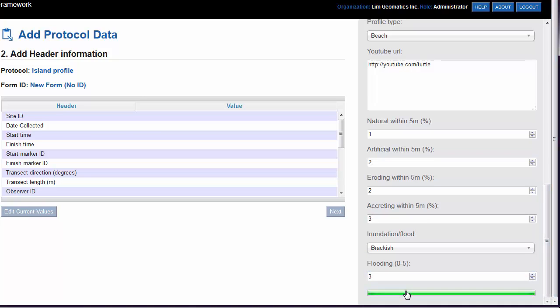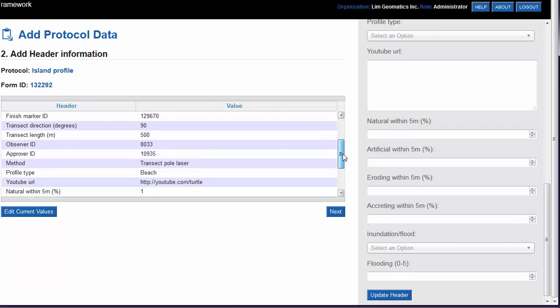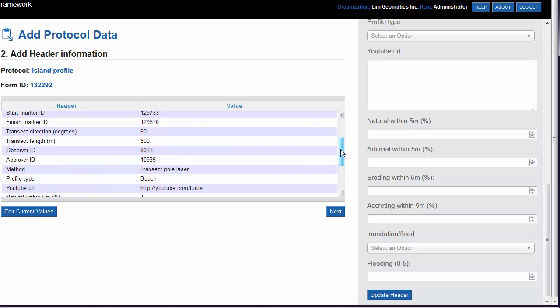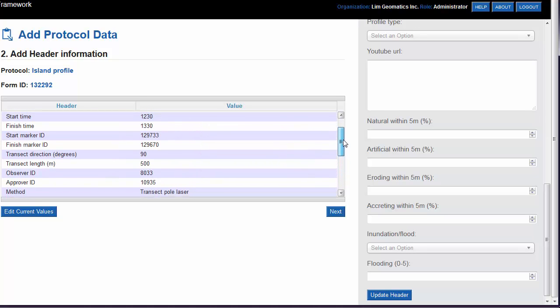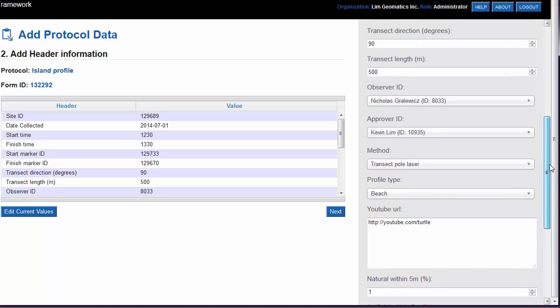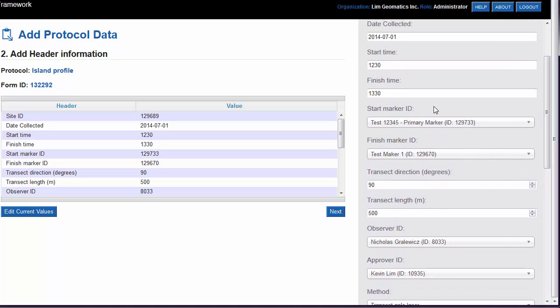Click on the Update Header button to add the information to the header. Review your header information. If you need to make a change to one of the values, click on the Edit Current Values button and go back and make the change in the header panel.